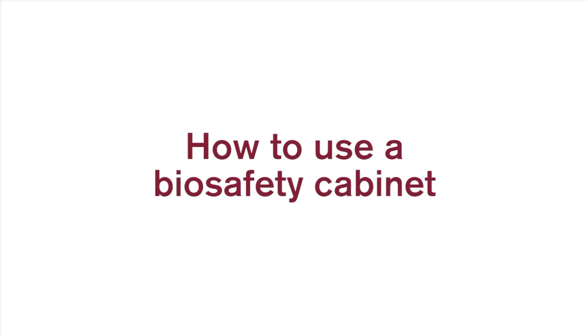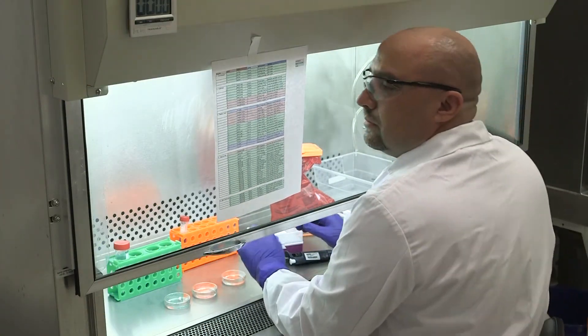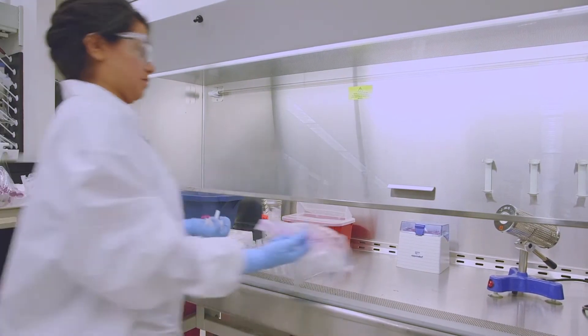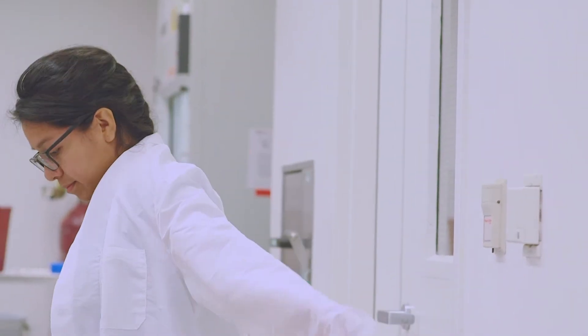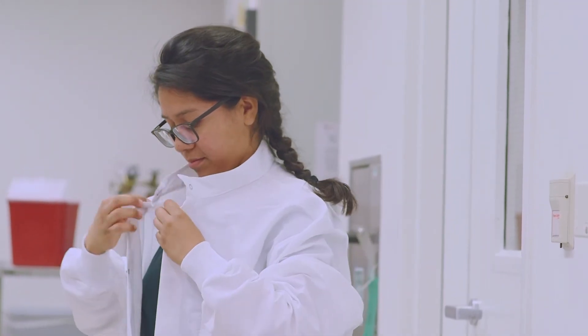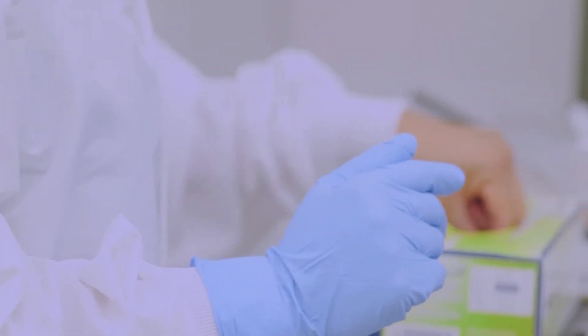How to use a biosafety cabinet — preparing for use. First, prepare your standard operating procedures and lab protocols. Then carefully plan your experiments, paying particular attention to all the materials and equipment needed. Pre-planning prevents crowding in the cabinet and inside-out motions that disrupt the cabinet airflow. Put on appropriate personal protective equipment or PPE, which protects you from the agents you are working with and prevents contamination of samples by skin flora. PPE at minimum should be a lab coat, gloves, and eye protection. Whenever possible, tuck lab coat cuffs inside the gloves.